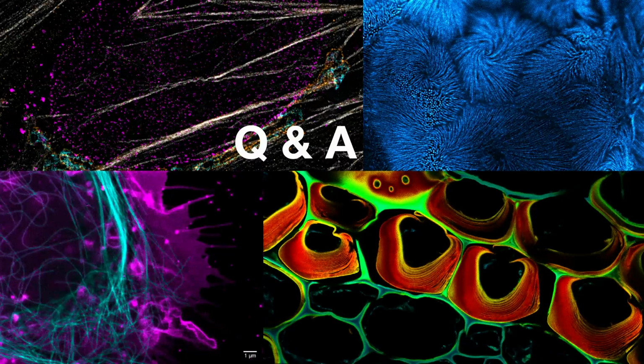A question about the detectors. Do you recommend to use always the matrix detector for TIMEBOW imaging? No, you can also use our standard APD detectors. In fact, if you have a system with maybe 3 APDs and 1 matrix detector, you can use all 4 channels for lifetime imaging with TIMEBOW.